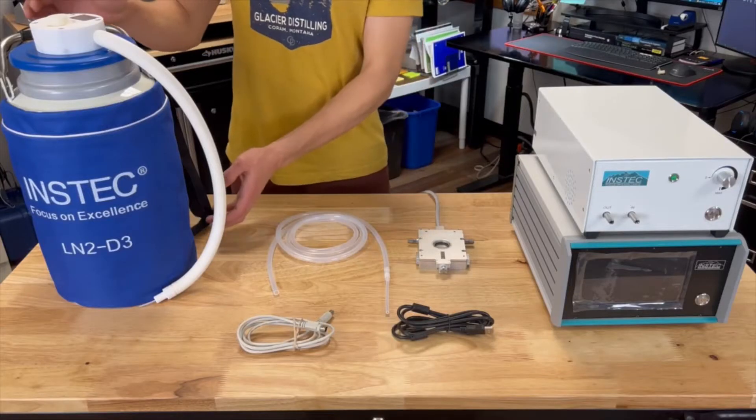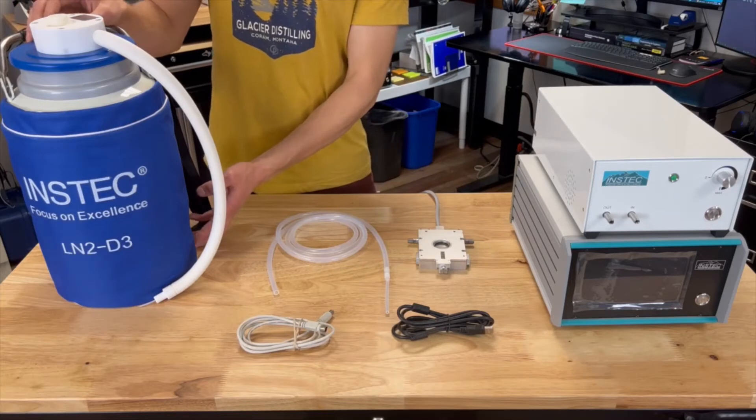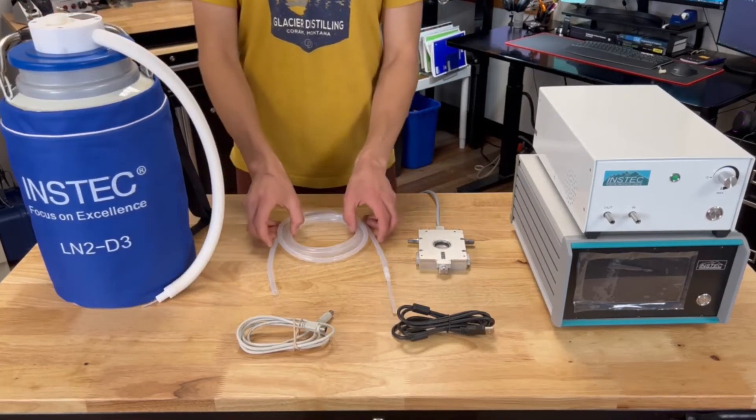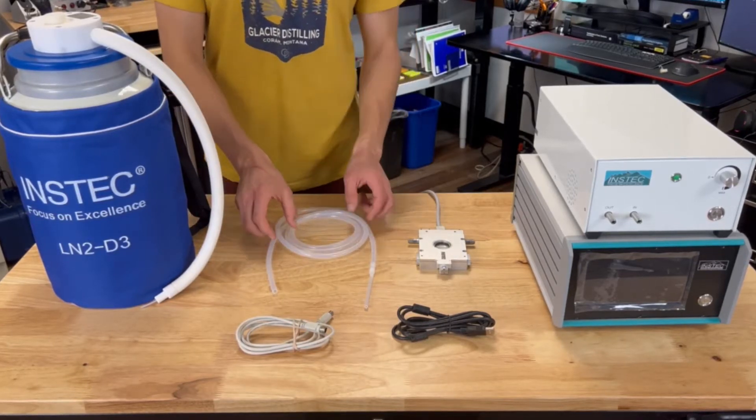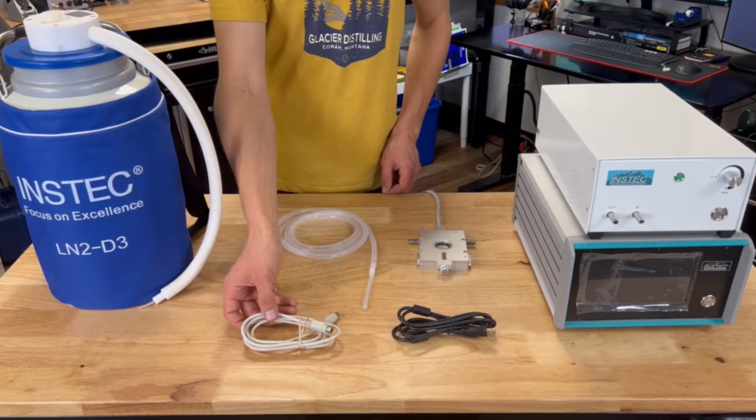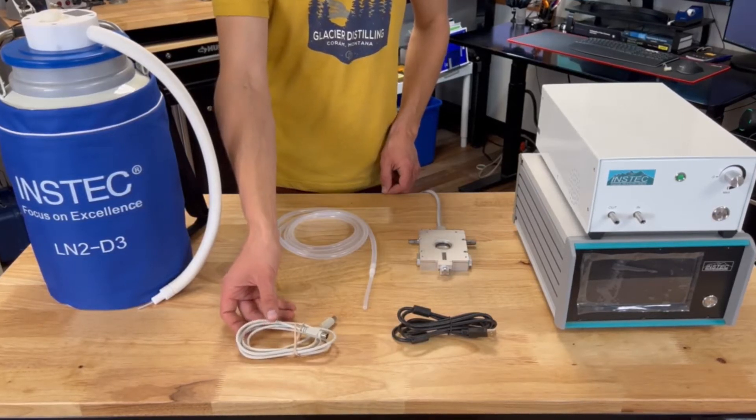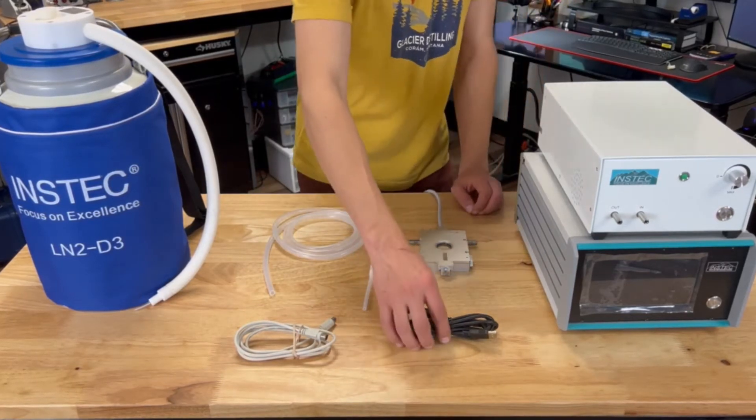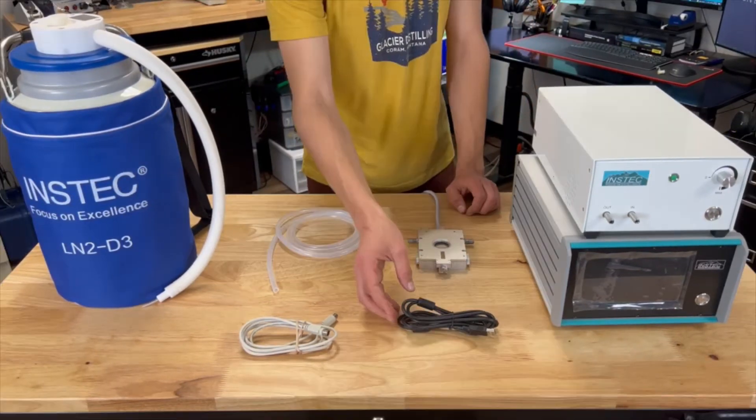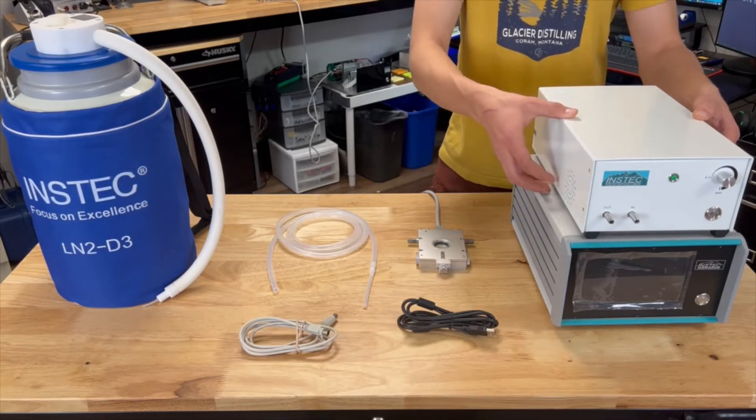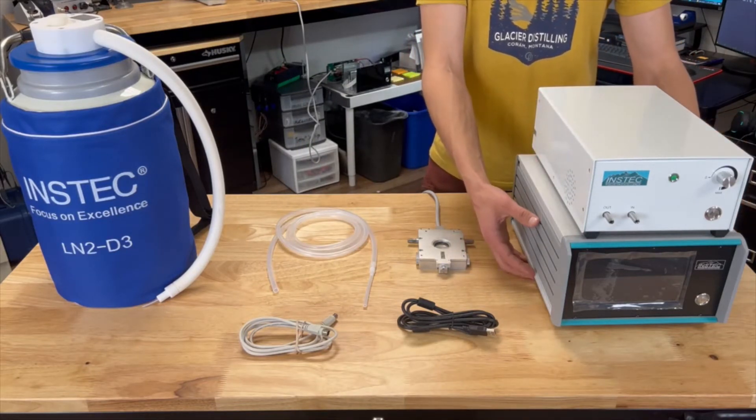Let's get started by introducing the liquid nitrogen system components consisting of a Dewar along with inlet tubing, the outlet N2 gas tubing, an I-O cable for communication between the suction pump and the temperature controller, a liquid nitrogen compatible INSTEC thermal plate, a power cable for both the temperature controller and suction pump, the LN2 suction pump (the sizing of which depends upon your application), and then of course your temperature controller.